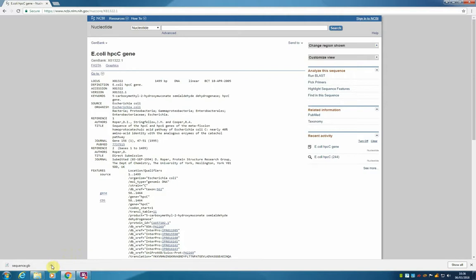This is going to automatically download a sequence into our download folder. To access that sequence we need to open it in a text editor. In this example I am working on a PC, but you will also have similar software on your Mac or Linux machines.